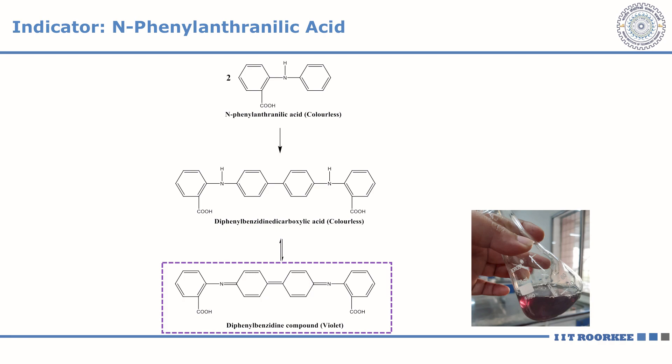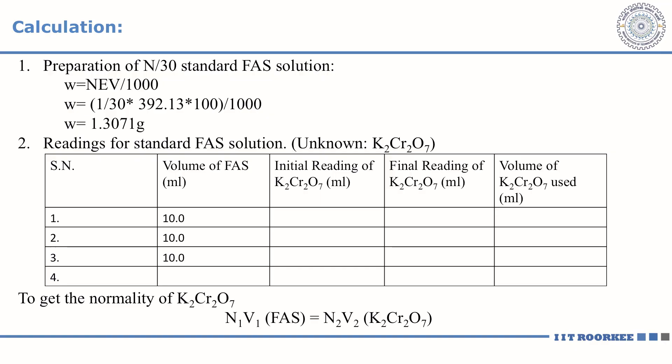We have achieved the end point of this titration. At the start of this experiment we noted down the initial reading. Now at the end point, the final reading is 19.7 and the initial reading in the burette was 10. We have to repeat this experiment until we get concordant readings, and then with the formula N1V1 = N2V2, we calculate the normality of the aqueous potassium dichromate solution.